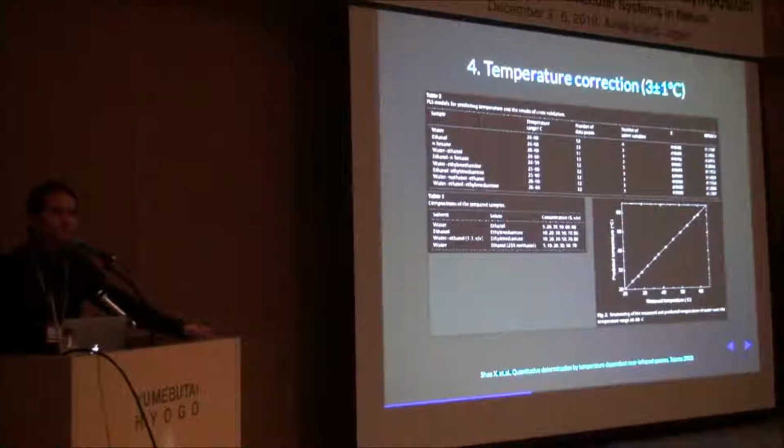I don't know about other instruments. I'm working with the Bruker MPA, and in the case of the Bruker MPA, we have a heating element, so we can heat, but we cannot cool the samples. And I don't think there are many other manufacturers. I hope I'm wrong. I hope there's something great out there, but despite all of that relevance and awareness about temperature, we don't have instruments to properly work with temperature. We don't have instruments that can cool and heat the sample and give really accurate measurement. That's kind of confusing to me if we know that's a problem and we're consciously not addressing it. So how are we going to solve it?